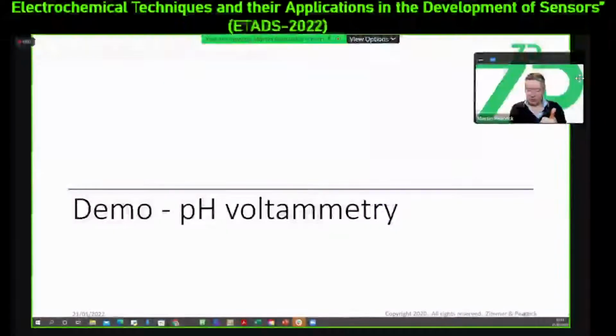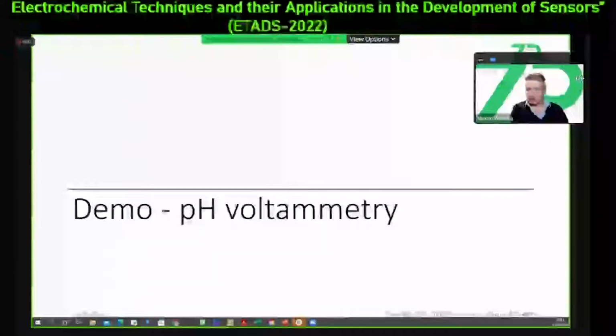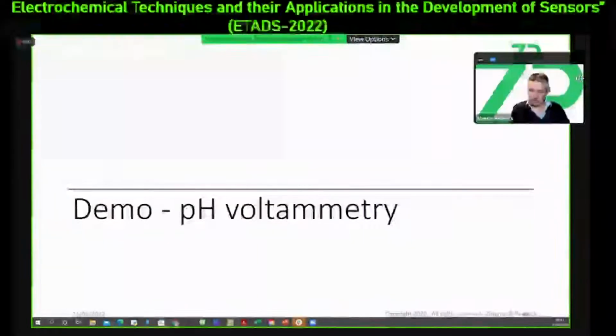And so if I just think about what we've run through, we've introduced those technologies. We've actually talked about the motivation for all of this kind of work, which is really because we think that electrochemistry and electrochemical biosensors can really be part of, there's essentially a revolution going on with the Internet of Things, having sensors in the environment. And therefore we transitioned to that nitrate rod, which has been a significant program for us, and a significant product.